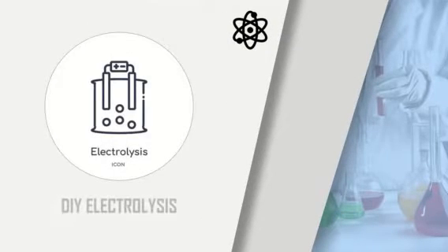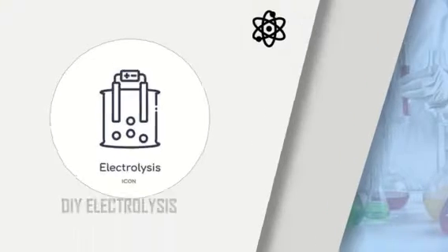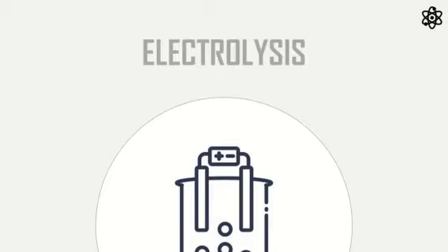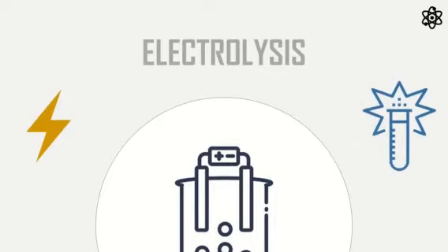I am now here presenting in this video my chemistry project about electrolysis, which is simply called DIY electrolysis. What is electrolysis? Electrolysis is the process of using electricity to produce a chemical reaction of ionic compounds. The more specific meaning is to split up and form new substances with the use of electricity, coming from the Greek word electrolysis, meaning splitting by electricity.